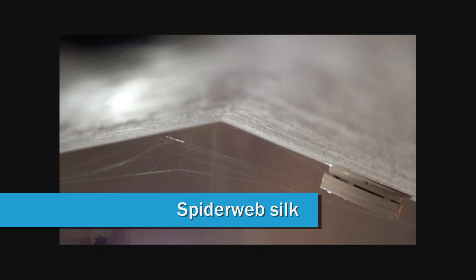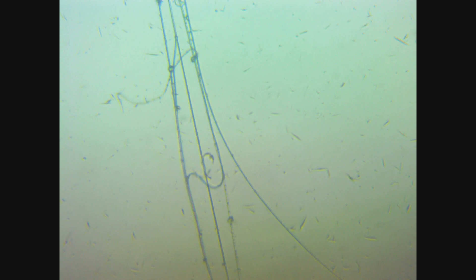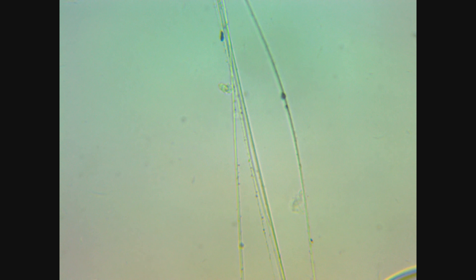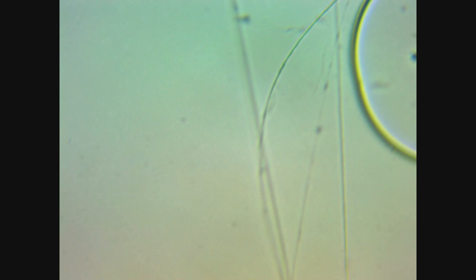Unlike the tiny Kilomonas paramecium, spiderweb silk we can see with the naked eye quite easily. So it's quite surprising to find out just how very fine and tiny it really is. If we look under the microscope, we see that a strand is composed of several strands. These strands are breaking and falling apart. They're also stretched very tight. I had problems trying to collect the spider silk on the actual microscope slide with the grating on it, so they're independently collected on a different one. But they're stretched tight as the process of trying to collect them.